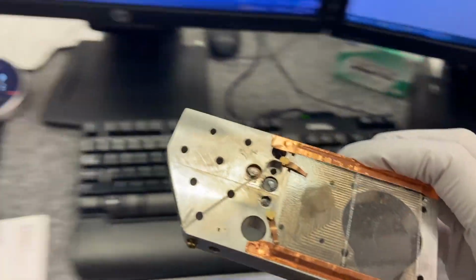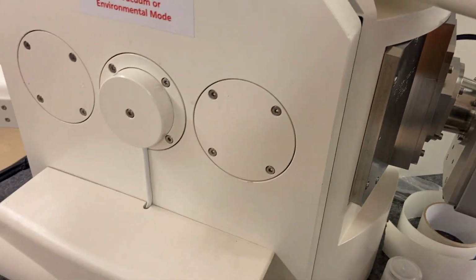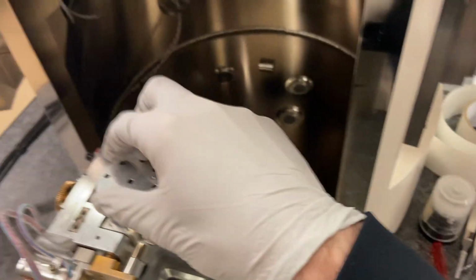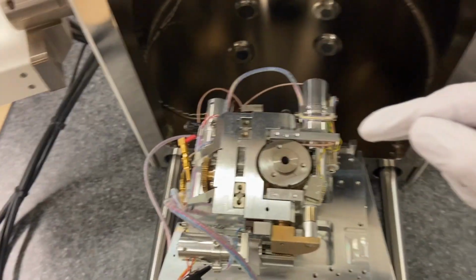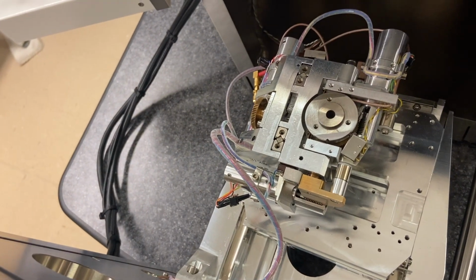So here's our essentially complete material that we're going to insert in here. So we have our sample ready to go. This is essentially what the SEM looks like when you open it. This is our stage right here. This is another sort of detector holder that we don't need, so I'm going to remove this one. And then I need to rotate this to be here, so let me just show you how that works.